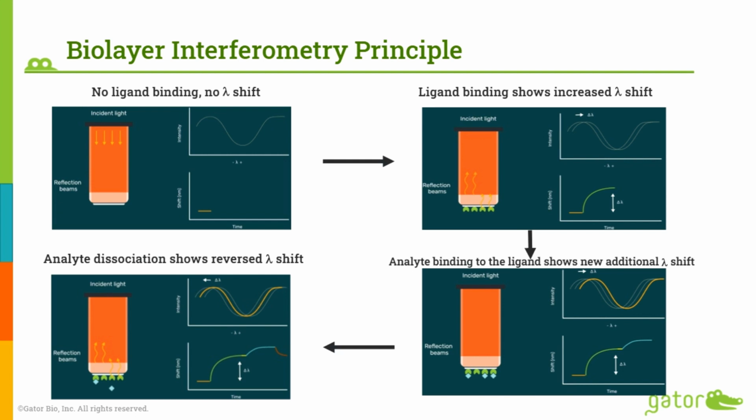That can be the amount that is being bound to the surface, so you can quantitate your molecules of interest, or it can give you an affinity on-rate constant, that is, what is the binding constant while it's binding. And it doesn't stop here.